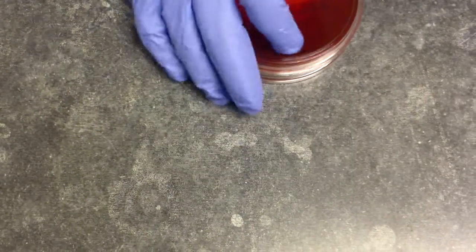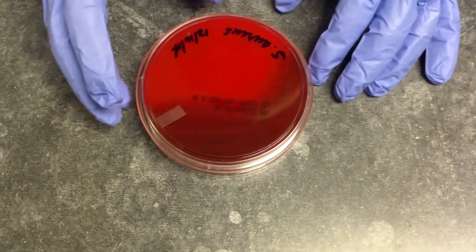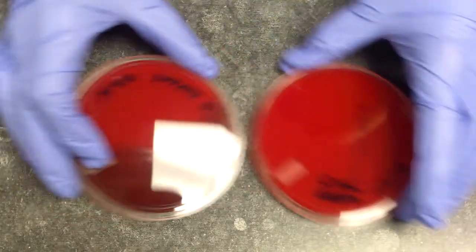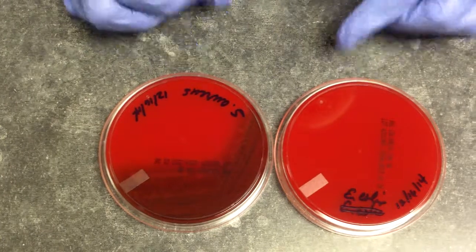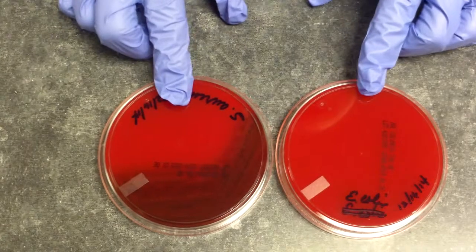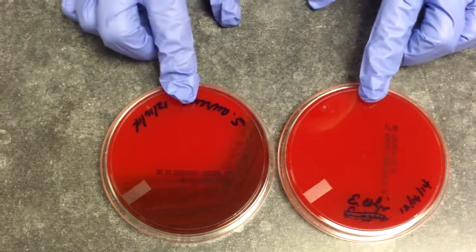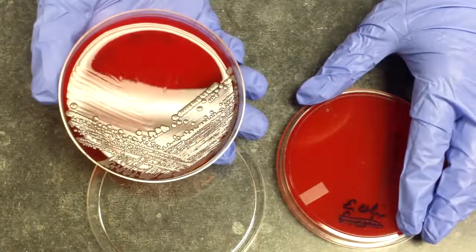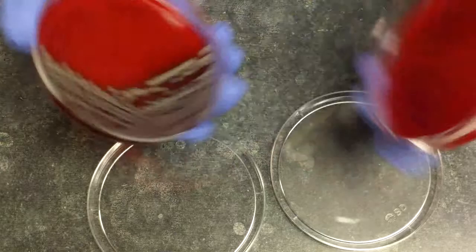Next, we have selective medium, which supports the growth of one type of organism and inhibits another type of organism. These mediums have antibiotics or dyes or alcohols in them to inhibit the growth of certain organisms. So we have a Columbia CNA agar, which has colistin and nalidixic acid incorporated, and this will allow our gram-positive organisms to grow, but will inhibit the gram-negative organisms.